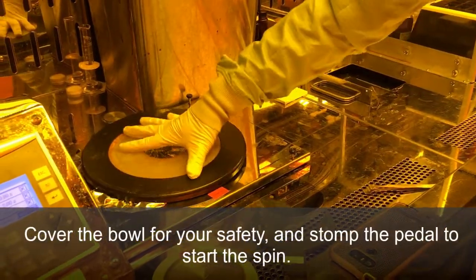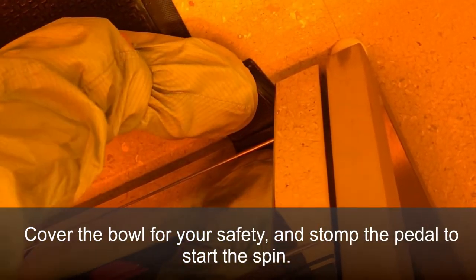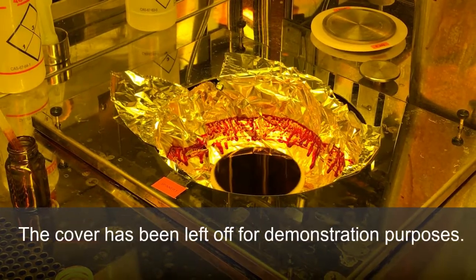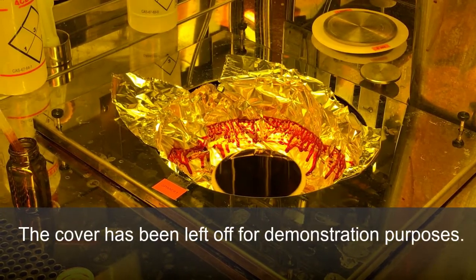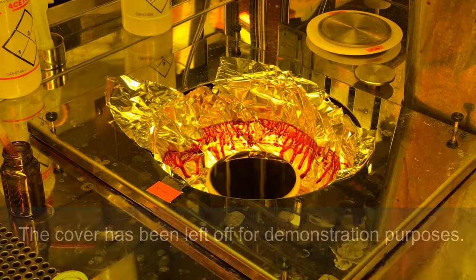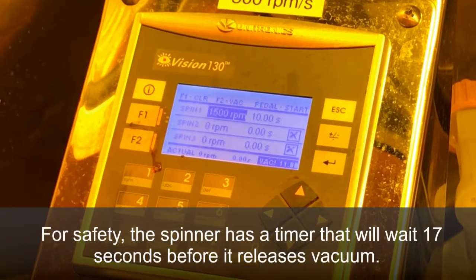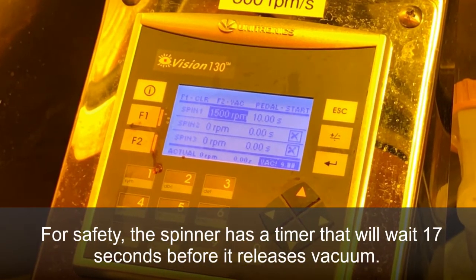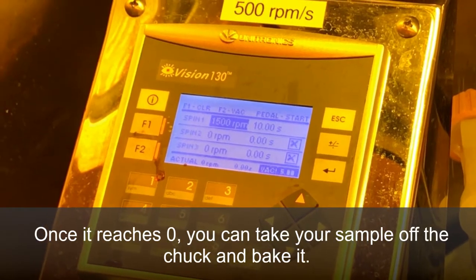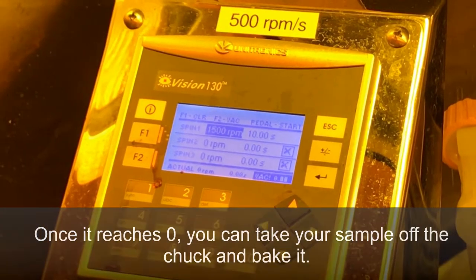Cover the bowl for your safety and stomp the pedal to start the spin. For safety, the spinner has a timer that will wait 17 seconds before it releases vacuum to your sample. Once it reaches zero and the vacuum turns off, you can take your sample off the chuck and bake it.